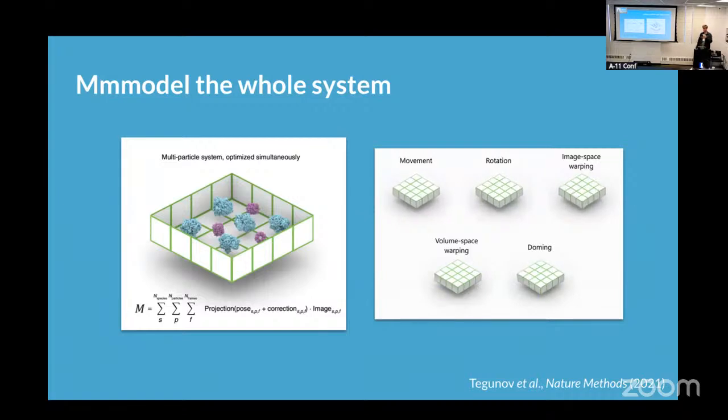You can even set it up to resolve that position changing over time if you want. And then it will try and optimize the shifts that align those images. It will try and deform those images a little bit to wiggle all the particles into place in case a rigid motion doesn't fully get them there.